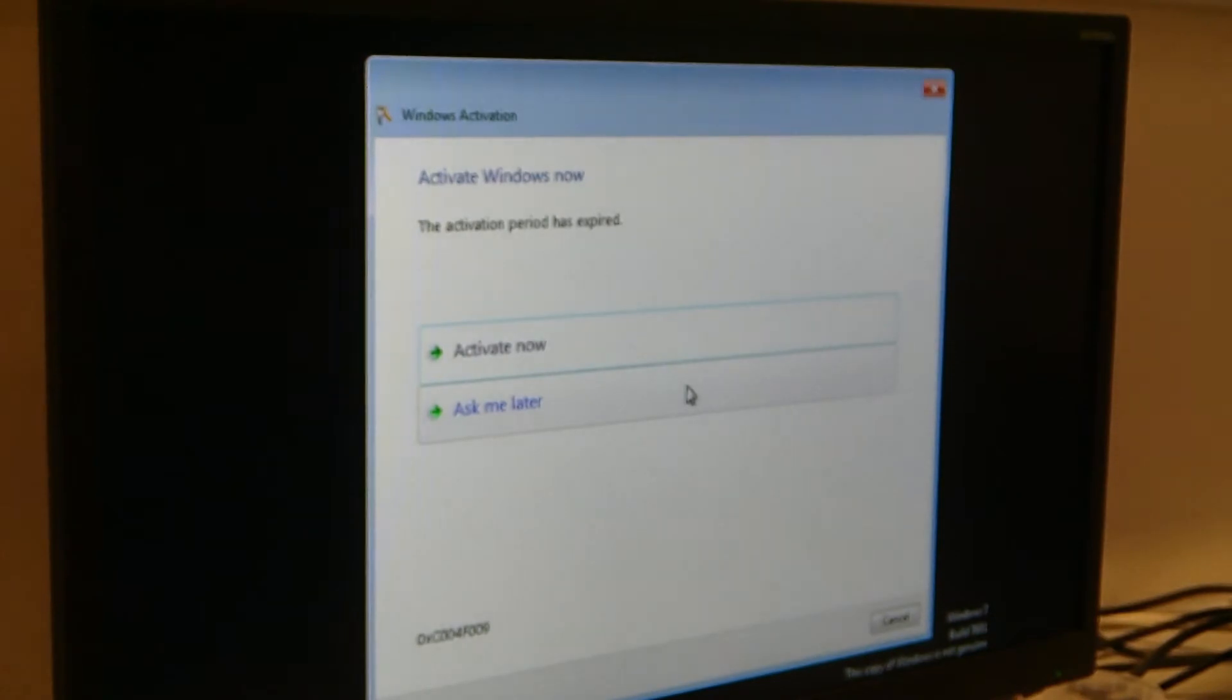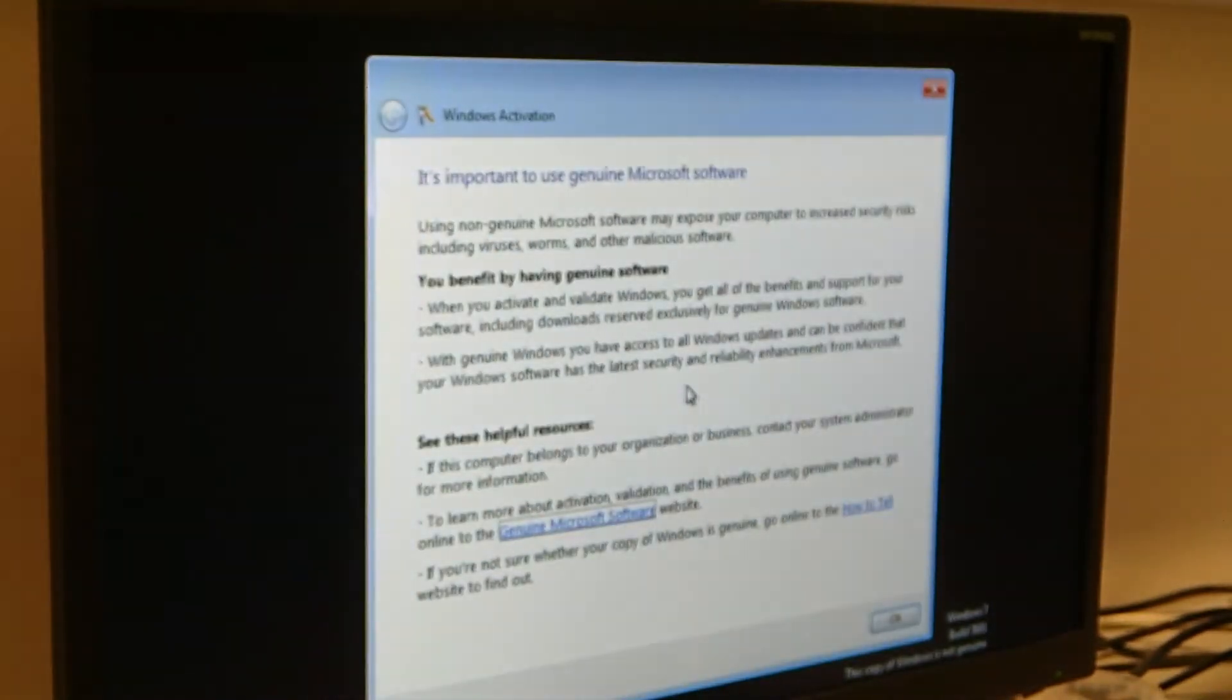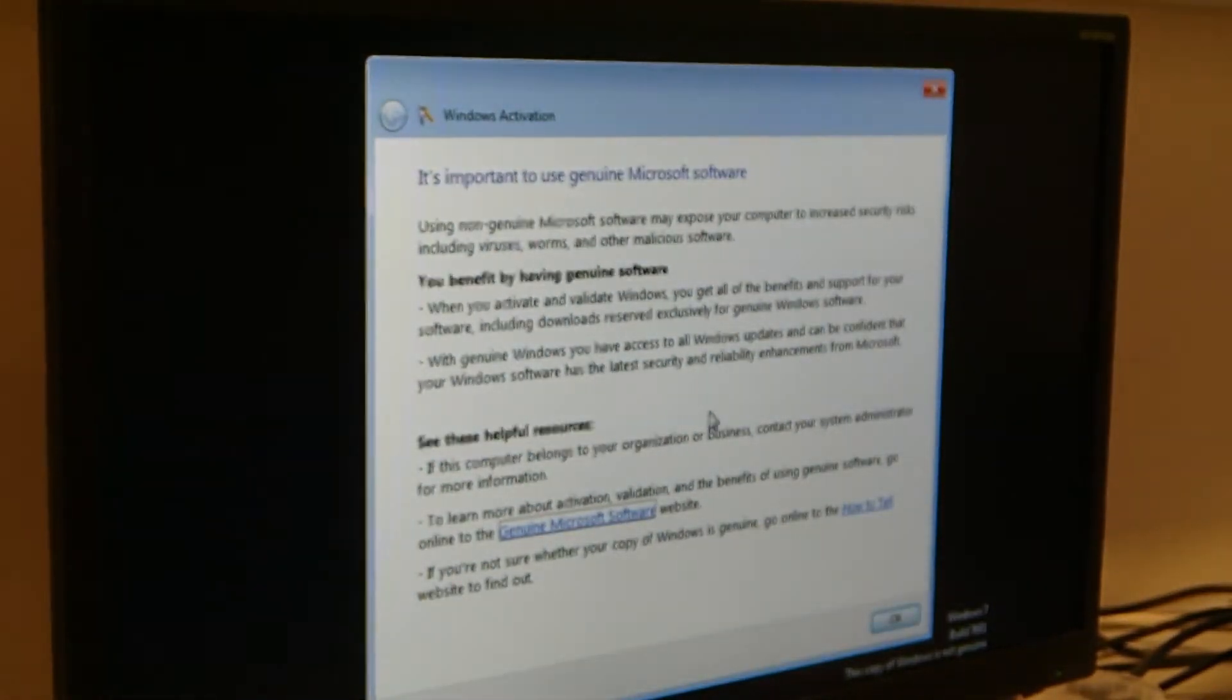You are always asked if you want to activate Windows. Don't do it. Just click ask me later. And here just click on OK.